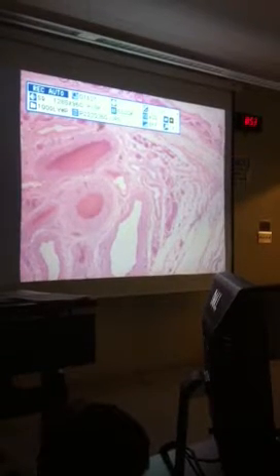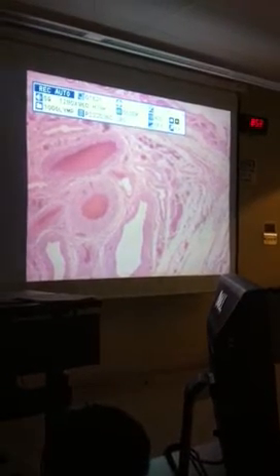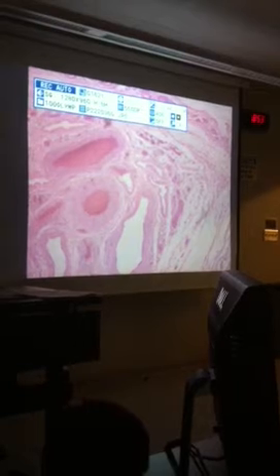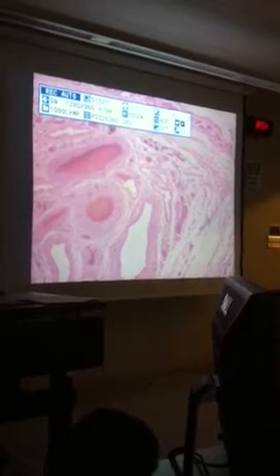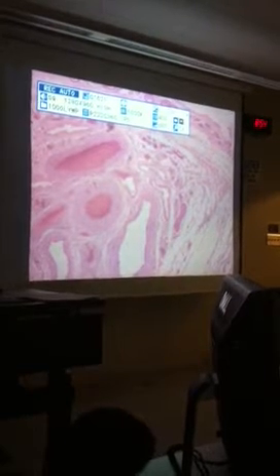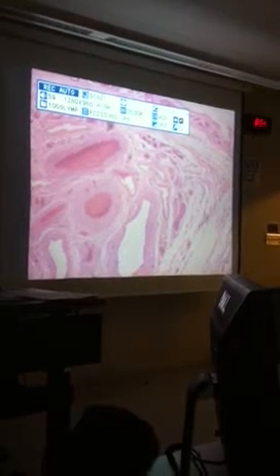No microvilli on these guys. They're just transporters, right? They're either transporting blood or they're transporting sperm or semen. So no microvilli on any of these.